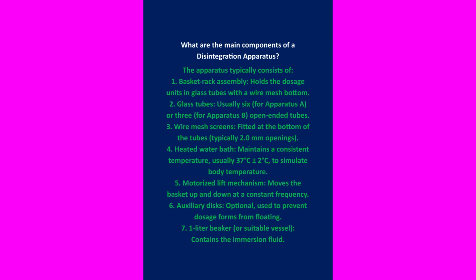Water bath. It maintains a consistent temperature, usually 37 degrees plus or minus 2 degrees centigrade, to simulate body temperature. Motorized lift mechanism moves the basket up and down at a constant frequency. Auxiliary disc, optional, used to prevent dosage forms from floating. 1 liter beaker or suitable vessel contains the immersion fluid.